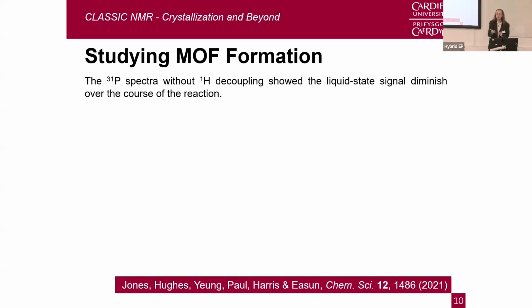Now, just to quickly run through the information we got from the 3 different types of spectra. The phosphorus spectra without proton decoupling do indeed show the liquid state signal of the linker, but all we really see is one peak which diminishes over time.